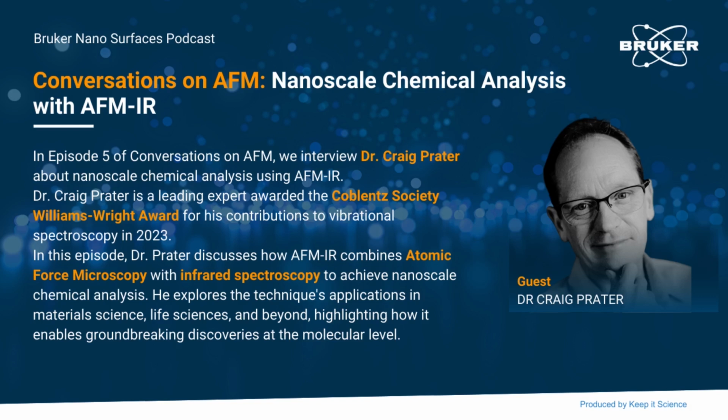Looking to the future, the big challenges that face the field and provide opportunities are to make the techniques more accessible, for example, such that lower levels of expertise are needed to get great results. Things that can make the systems faster, more automated, more economical for certain applications. Those are all areas that are going to enable an even greater impact.